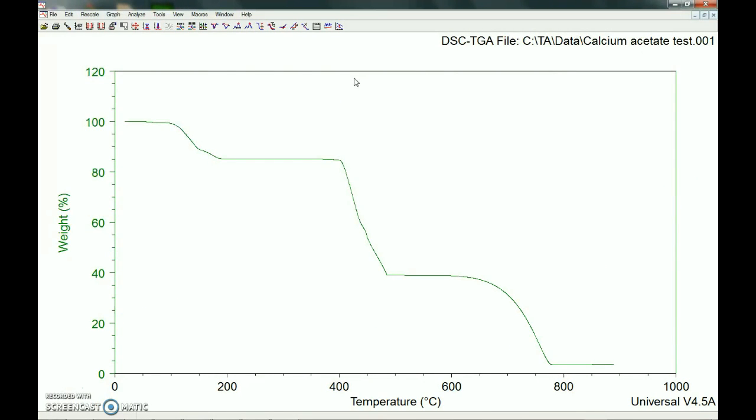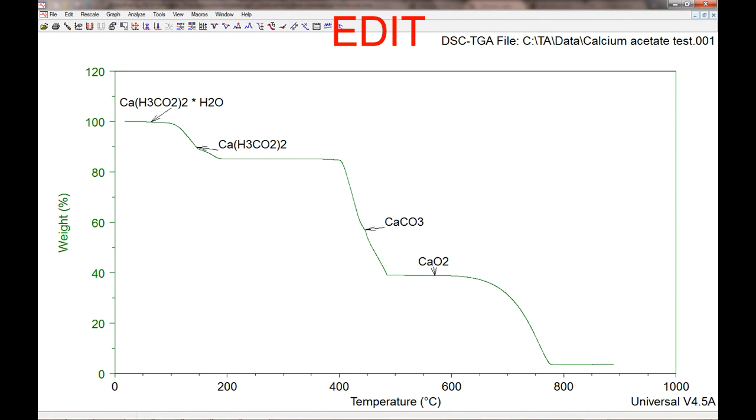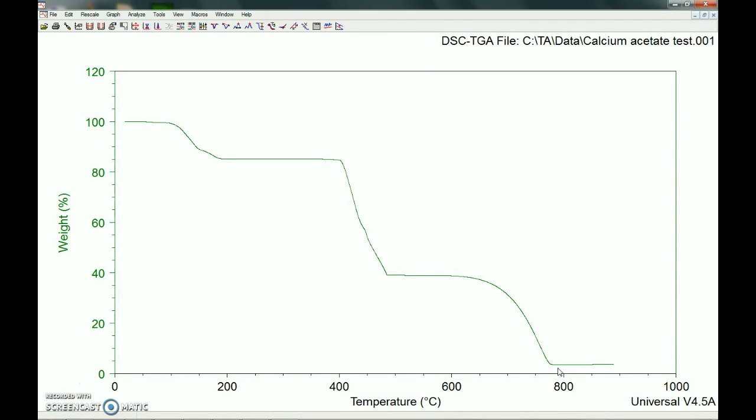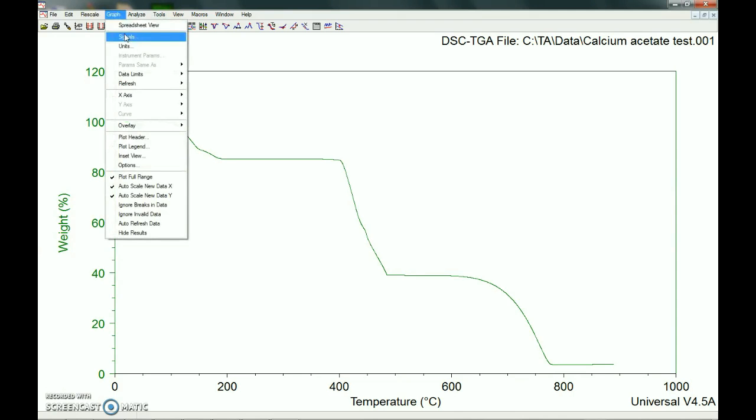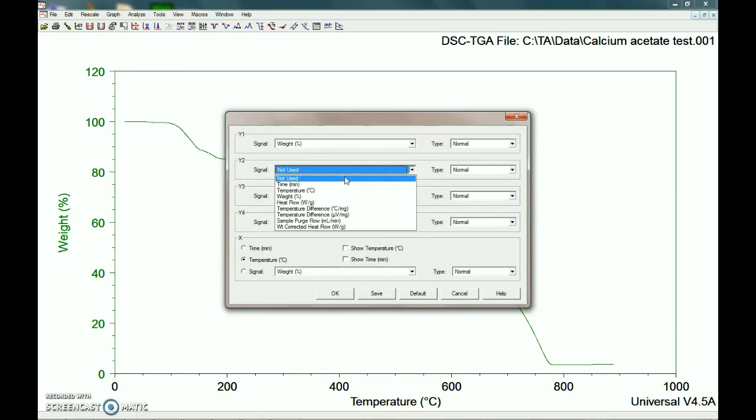We did calcium acetate. So most of the time in your sample, you'll have some water. This first ramp here is around 100 degrees Celsius, which is about the boiling point of water. So that weight percent lost there is just the water evaporating off. So it holds steady for a bit, and then we get to 400, and then it starts to decompose. So calcium acetate's first decomposition product is going to be calcium carbonate. Then it holds steady for a bit, and then it goes down to near zero.